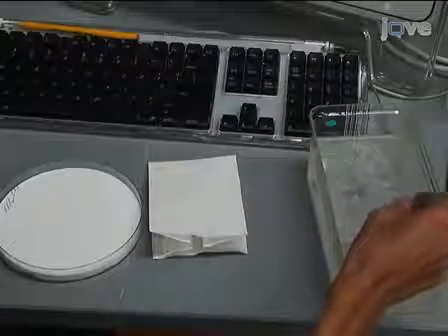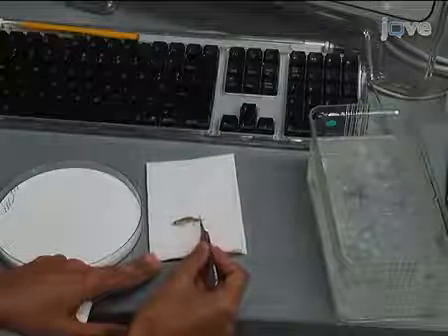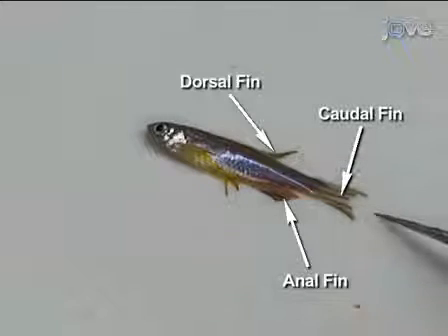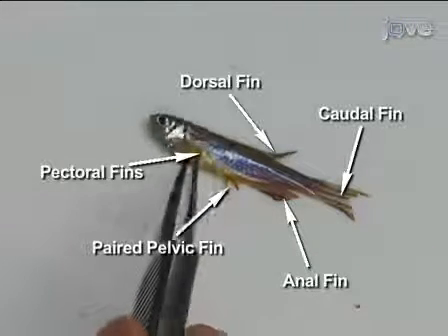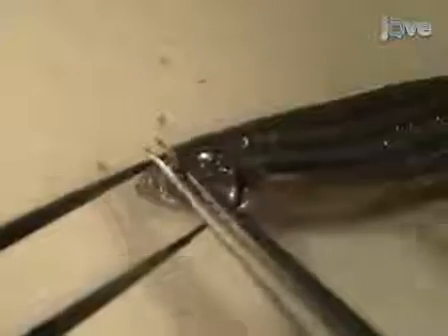Lightly pat the fish dry on a paper towel and place it on its side on a dissecting mat. Zebrafish have single dorsal, caudal, and anal fins and paired pelvic and pectoral fins. Use dissecting pins to pin the fish to the dissecting mat through the fleshy part of the tail and the ventral part of the eye socket.